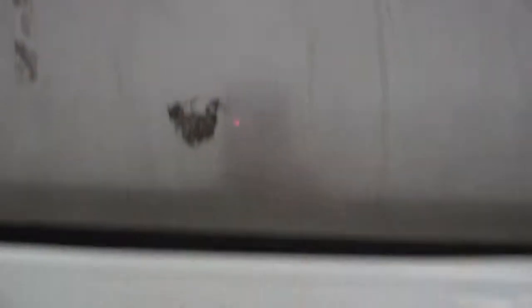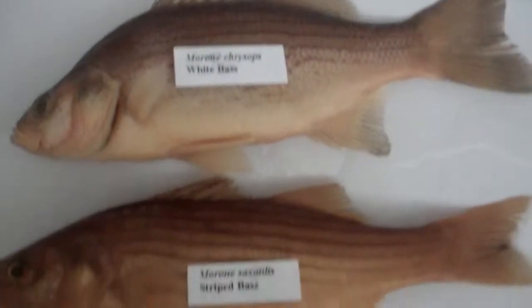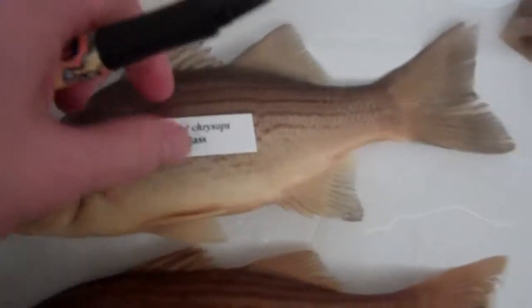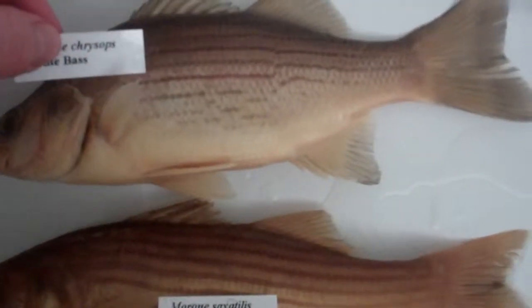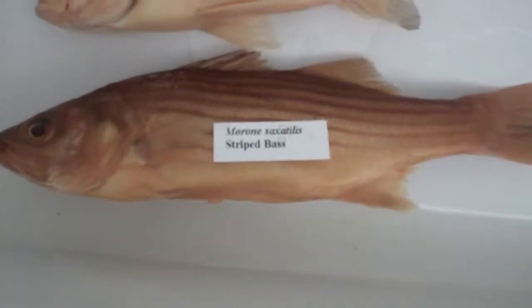Here we have family Moronidae — white bass and striped bass. You can see the lines aren't quite continuous on the white bass, but they are on the striped.